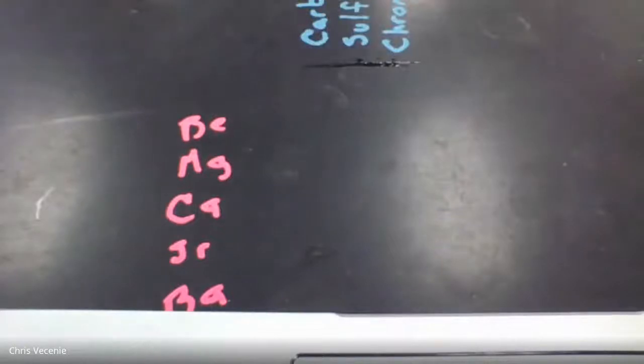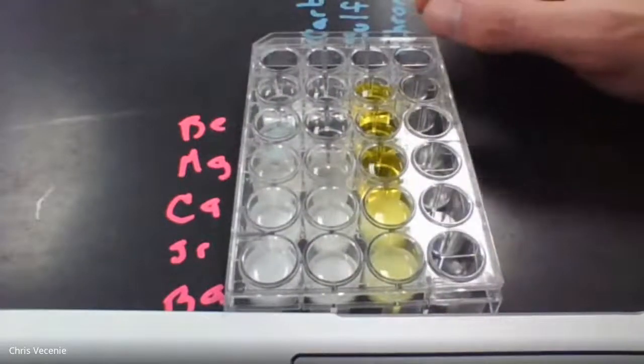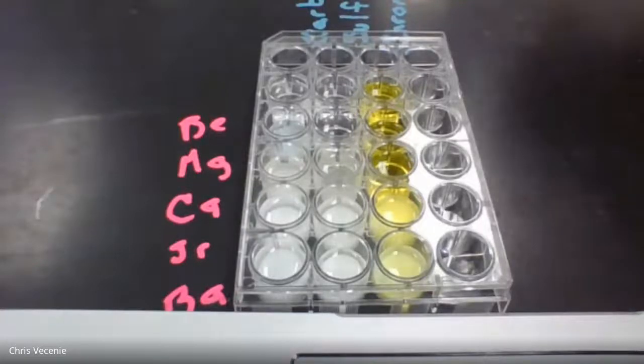I started this experiment a bit earlier in the day, so I'm going to bring in the one that I had set up earlier. So here is what you would have seen 10 minutes later.